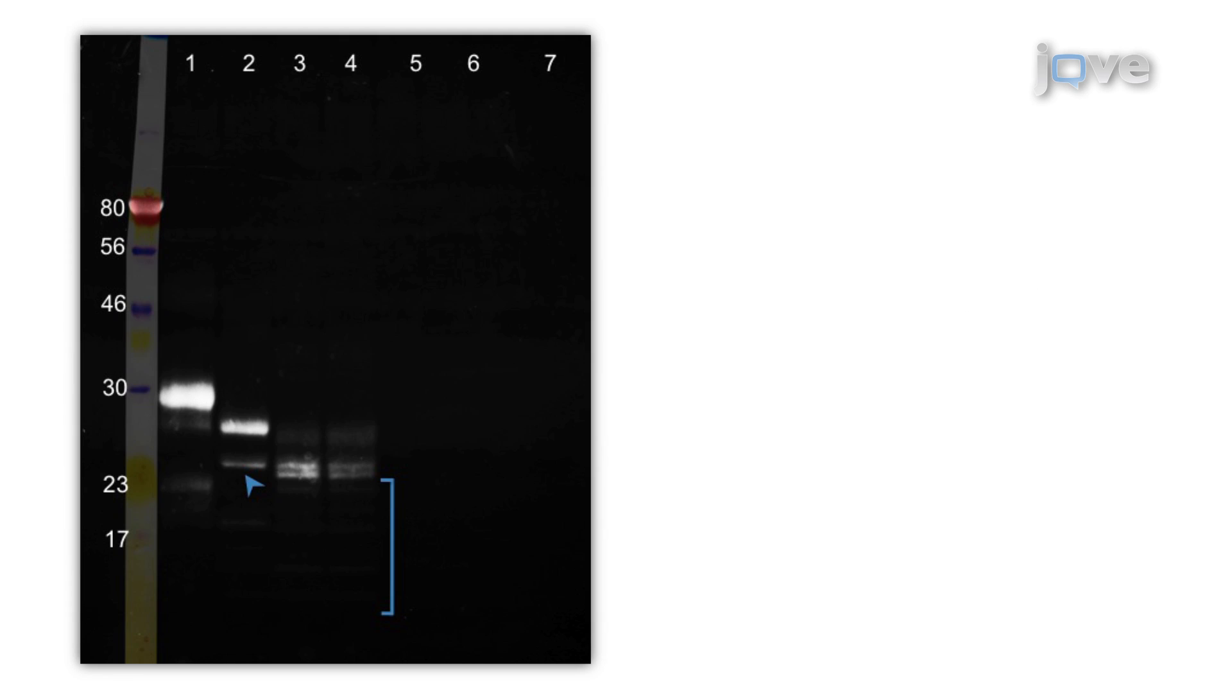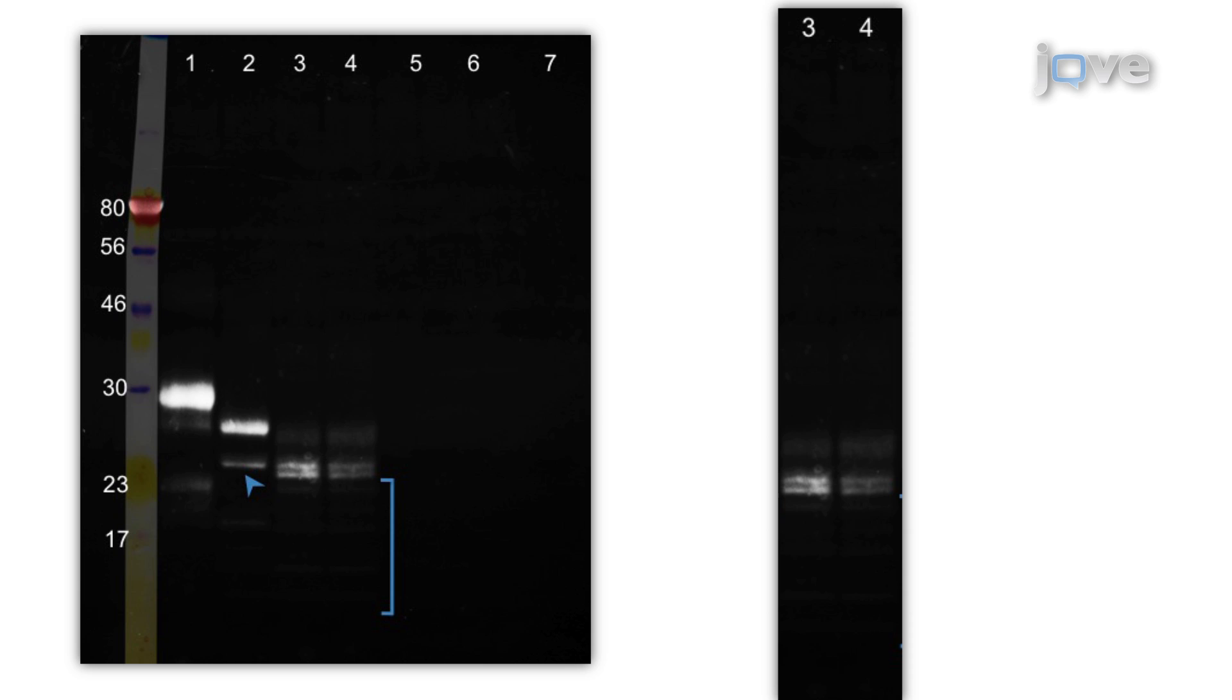The emerald green reagent oxidizes and stains all glycans present in a protein molecule. Therefore, the intensity of the signal decreases as HCG-beta is enzymatically deglycosylated. The residual signal in lanes 3 and 4 indicate the presence of glycan motifs which are resistant to the enzymes used.